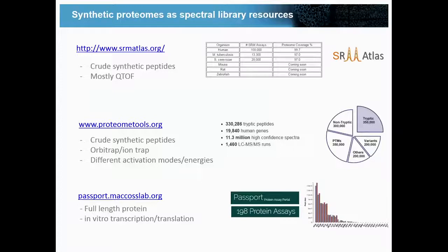So it means that some of these peptides will be good, but some of them may not be particularly useful. There's another resource now, a paper just came out from Bernard Kuster's lab where they're trying to do something similar, and I think the peptides from this project are maybe a subset of the peptides from this project, that they combine them together, at least some of them.